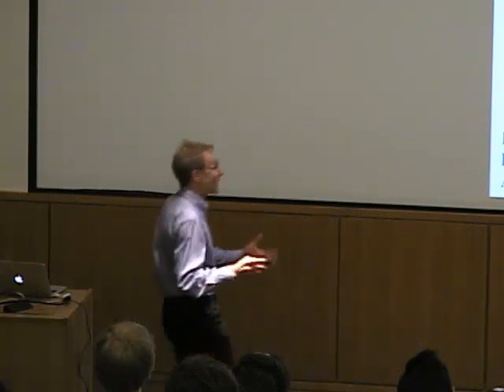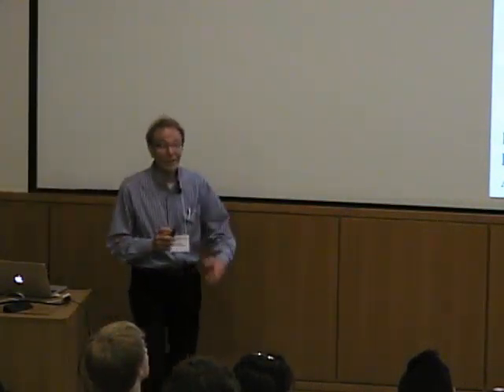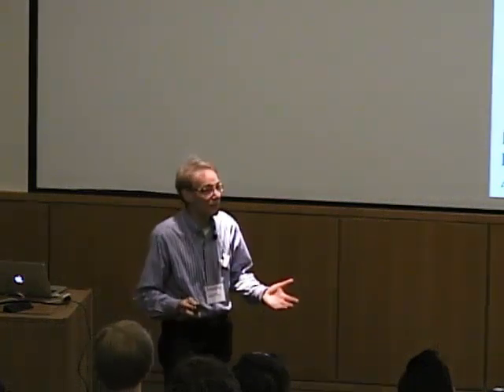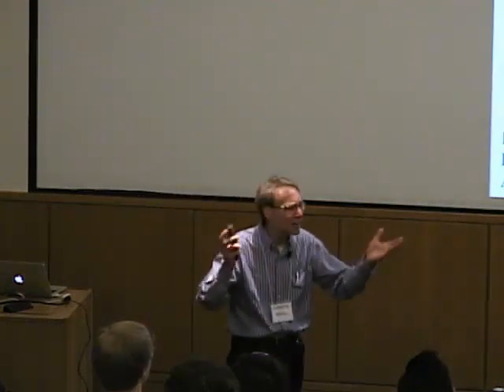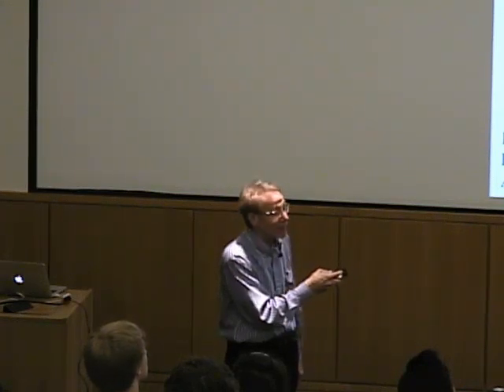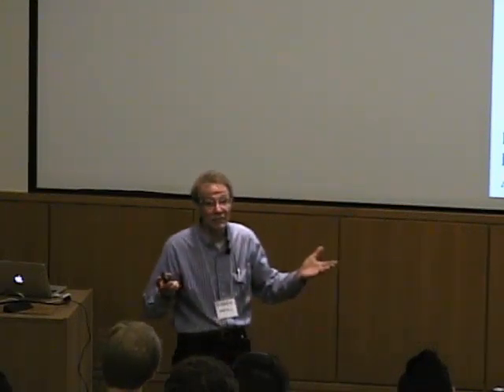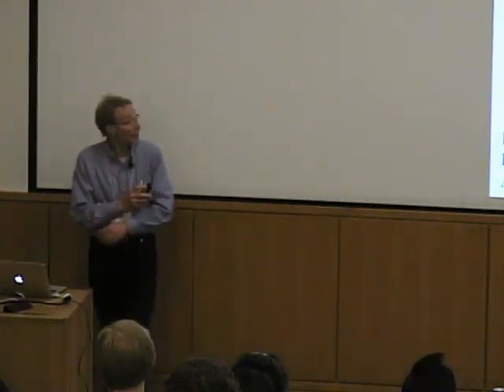So, how did they analyze the data? It turns out they were collecting this data in this very unusual buffer. Anyone ever heard of choline chloride buffer? It's a quaternary amine buffer, and with this positive charge, the assumption was that it didn't interact with the metal very much. Okay? So that was the buffer they basically had to use to collect this data.